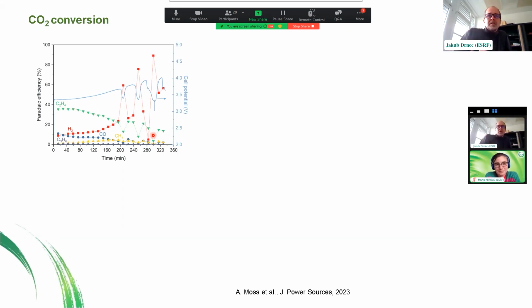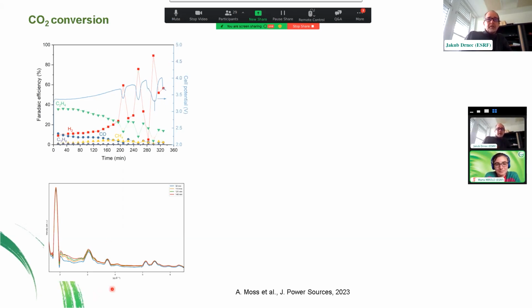So what's really causing this? You look at the diffraction pattern, and one of the features is that, of course, we are changing here. This is some kind of subtracted and in log scale. Don't pay too much attention to this, but what's really changing here is the background, right? The background is important in this kind of experiment. The background is typically your electrolyte or water. So there is movement of the anolyte through the membrane onto the cathode side, right? And now, looking at the diffraction pattern, we can actually look at the water distribution in the cell as a function of applied current.